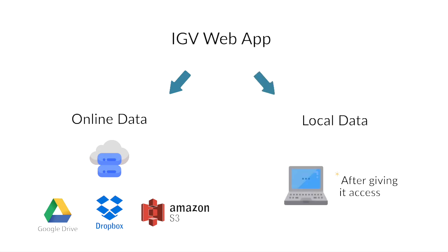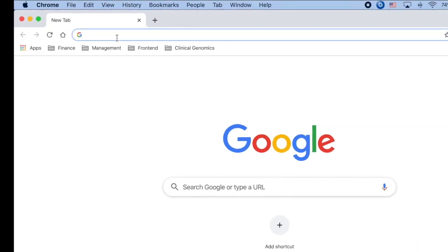Note that no IGV Web App user data is uploaded to an IGV server. The IGV Web App runs completely in the browser. There is no server behind it. Now that we understand the basics, let's open up the IGV Web App and load some data.